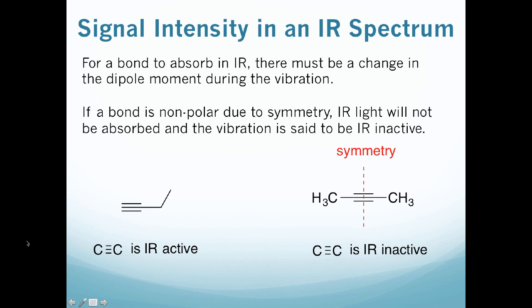The next thing we're going to take a look at is the signal intensity in an IR spectrum. In other words, if a molecule does absorb a certain energy of light and a signal is produced on an IR spectrum, how intense is that signal going to be?